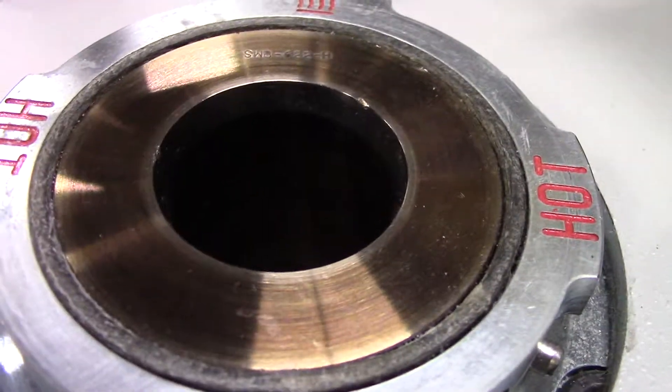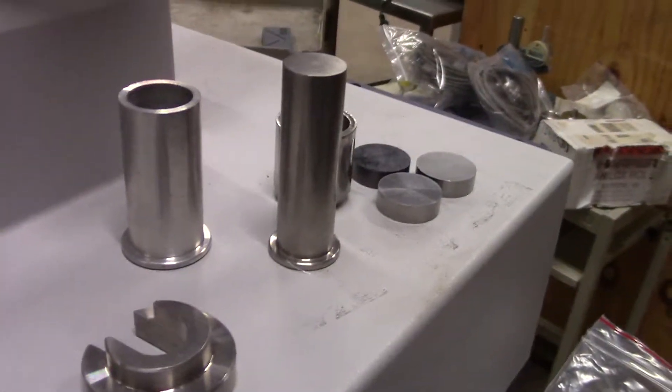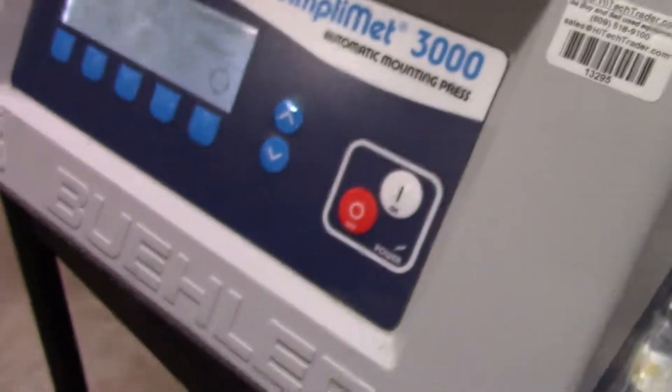The size of the area is approximately 31 millimeters wide by 80 millimeters deep. Here's some of the presses that we have. Some of the instrumentation it comes with — it's for your drivers and whatnot.